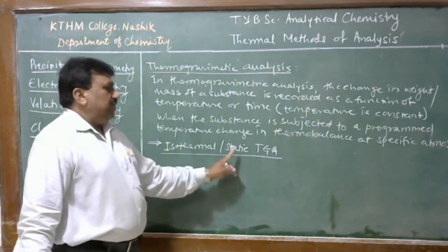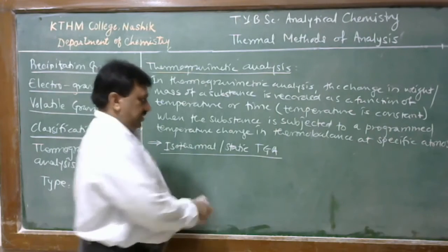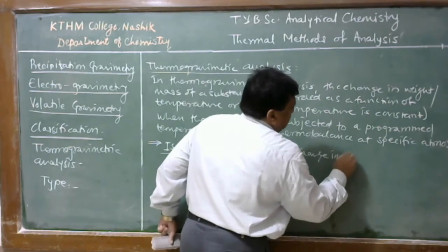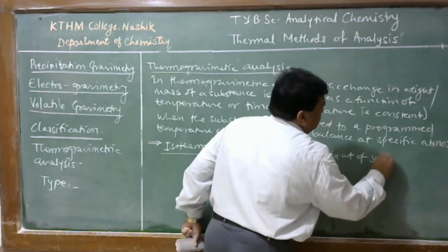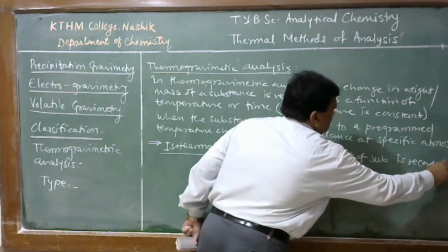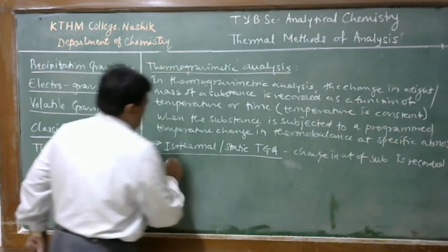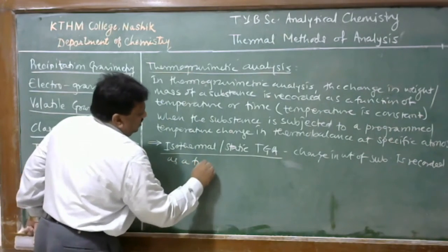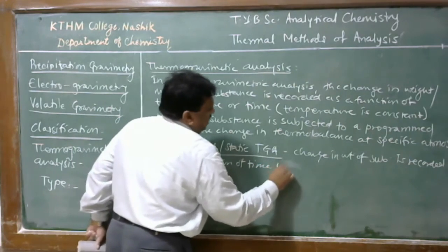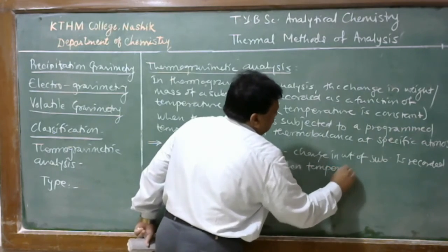Here, the change in weight of the substance is recorded as a function of time when temperature is constant.